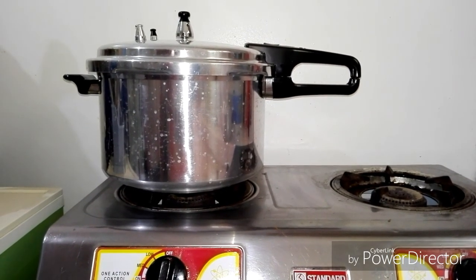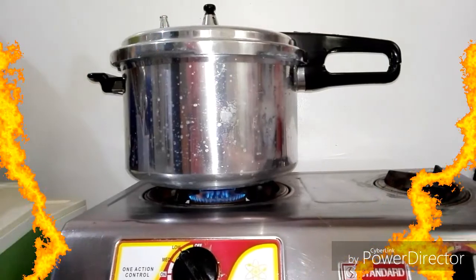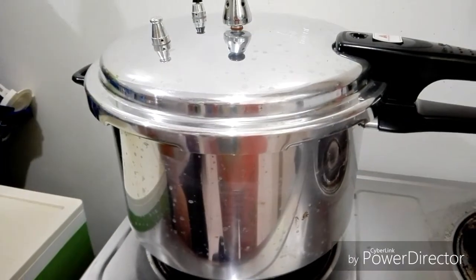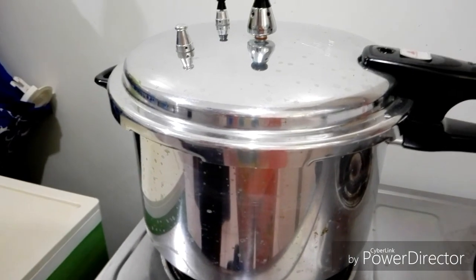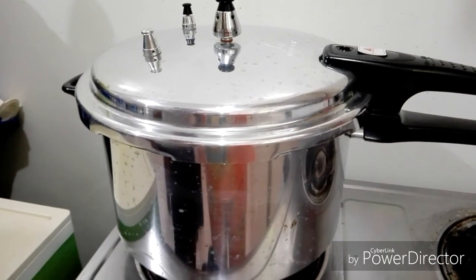I will now sterilize the flask for about 30 minutes. We're back after 30 minutes and I'm going to check what happened to the flask inside the pressure cooker.